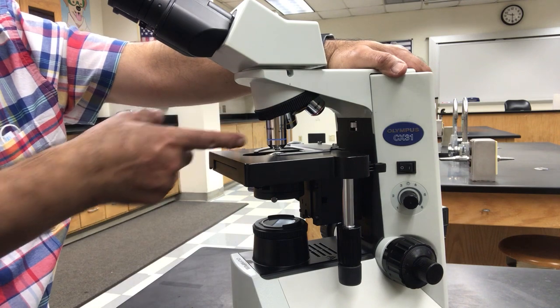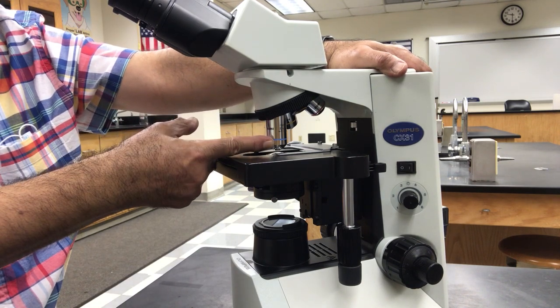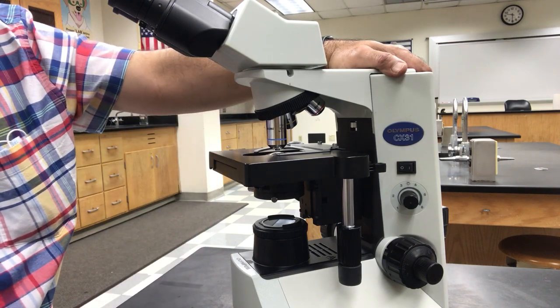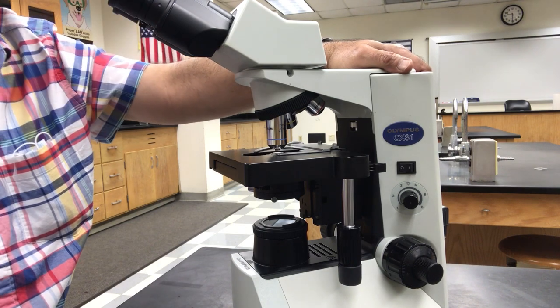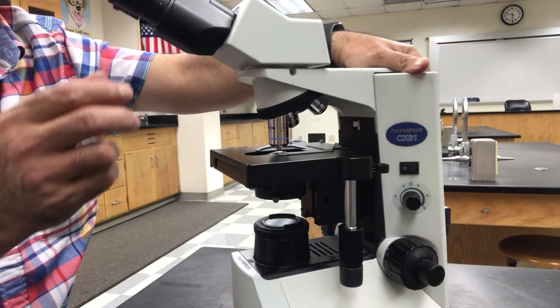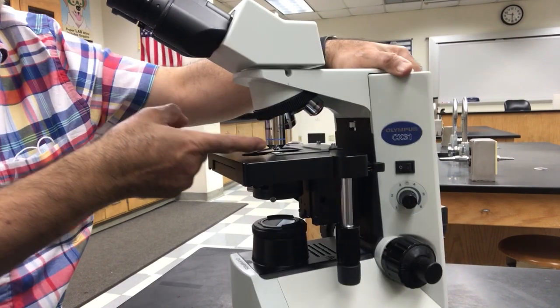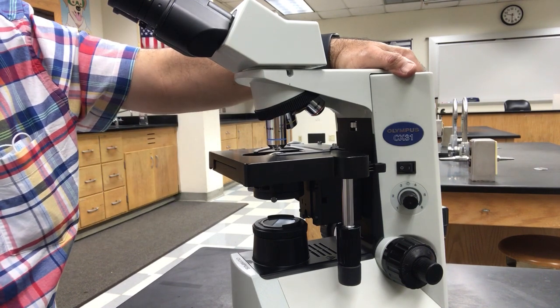So you have to determine, like you're looking at the object with the high power, what would be the total magnification? To determine the total magnification, you would have to multiply the ocular lens magnification power with the magnification power of the objective lens.